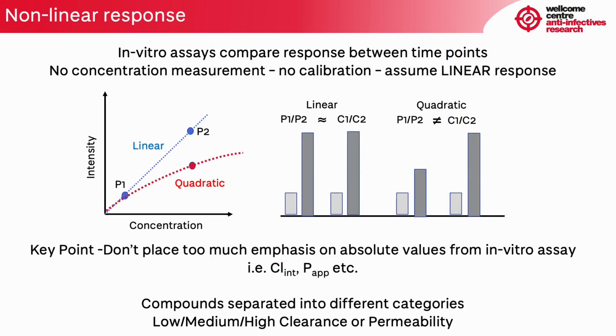What are the effects of nonlinearity for in vitro assays? Most in vitro work is done by comparing response between time points. No calibration line is used, and the response is assumed to be linear and correspond to concentration. The effect of nonlinearity can be seen in the diagram.